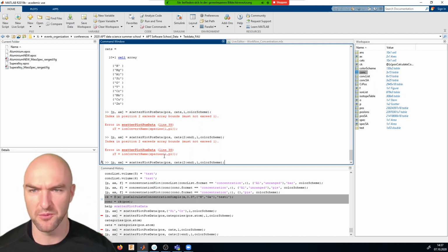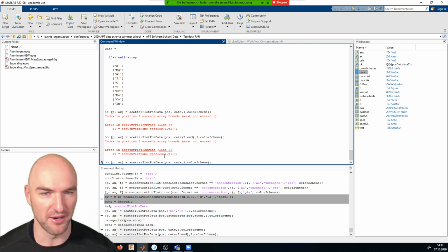Valentin, to have an idea what I did wrong, was there any change to the function that I might need to be aware of? Unfortunately, I have no idea why it doesn't work. But it should work that way, right? I guess so, yeah. So it's not just you people out there, it's also me, obviously, that occasionally runs into problems.